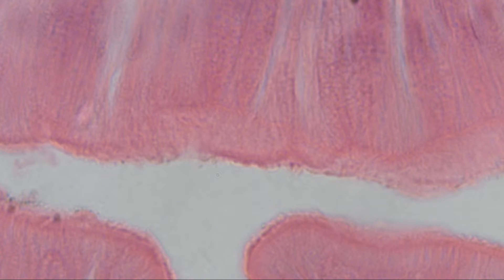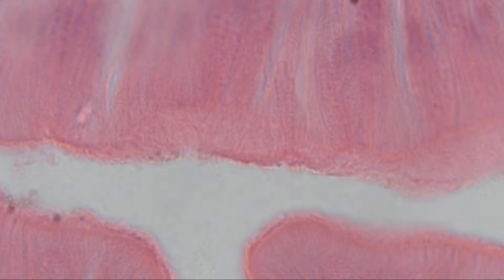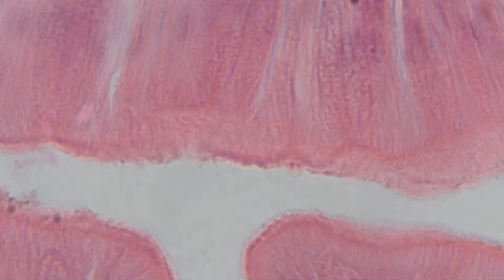And when we use these DIN objectives on the same magnification, this is the same slide, you might notice that the center of it is in focus but the outer edges are not. So if I move the fine focus you can see it focus from the outside to the inside.